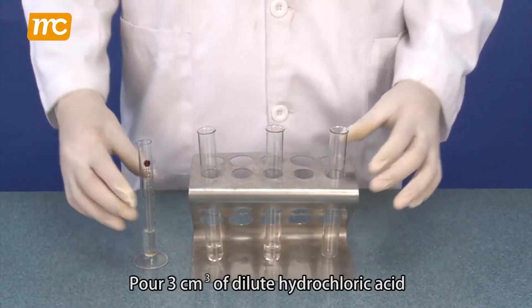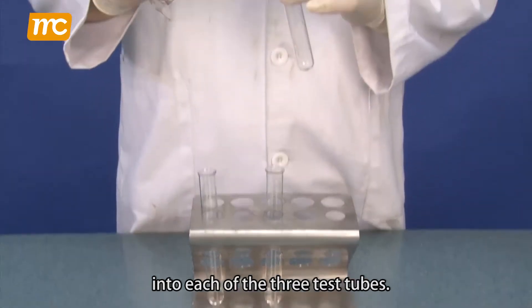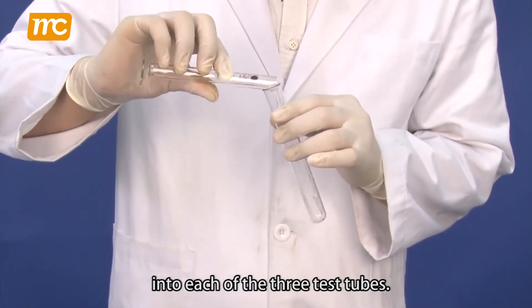Pour 3 cm³ of dilute hydrochloric acid into each of the three test tubes.